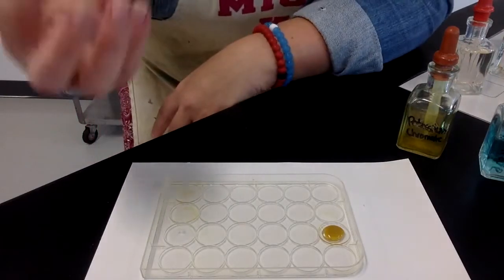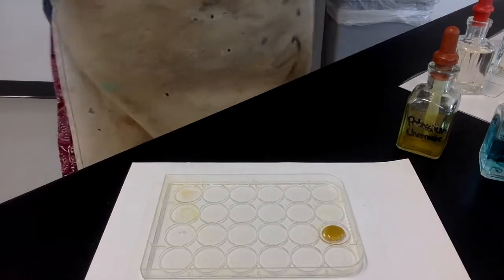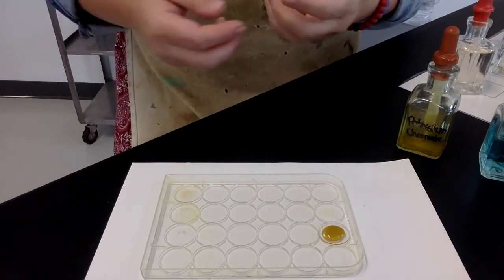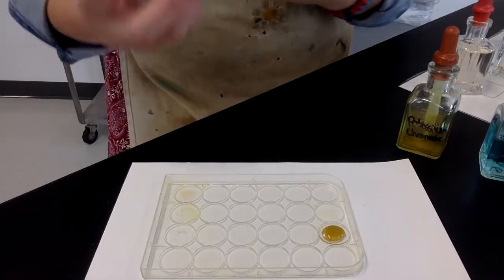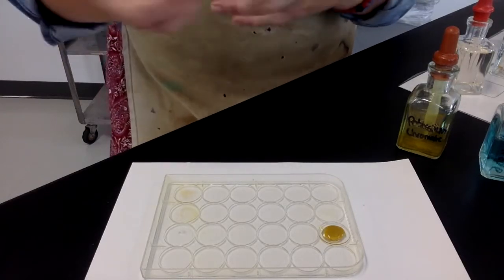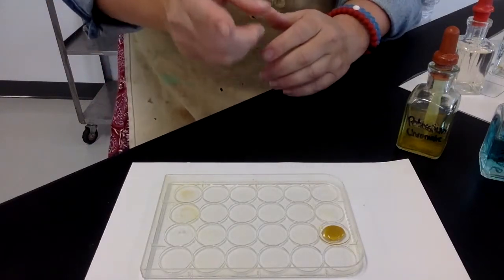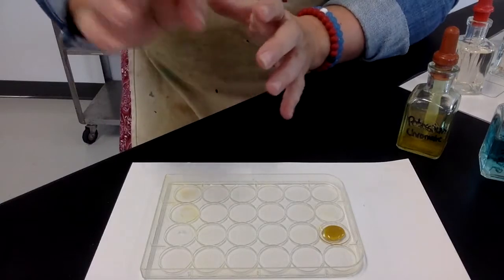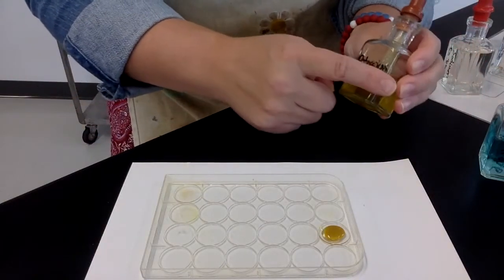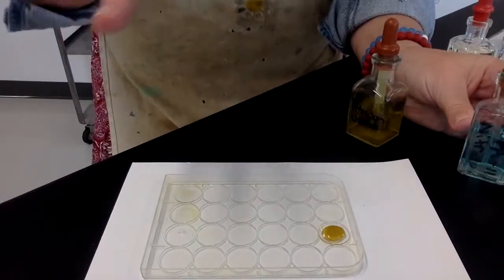Look at how it looks thick and kind of chalky. And it's kind of like a mustardy yellow. So that's what you put in the blank where it says describe the precipitate. So like thick mustard or chalky yellow, like dark yellow, something like that. That's your precipitate. So then you're also going to do the thing where you write out the 4 ions. So one of the ions would be potassium, another ion would be chromate, and then you'll have copper and nitrate. So those are your 4 ions.